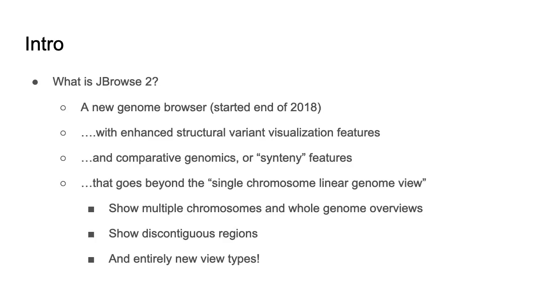And I'll just add a little thing that I think is fun, which is sometimes those are two sides of the same coin. The closer the species are, a structural variant is really just visualizing the comparison between those two things. And we try to support that type of thing. I'll just get into the visuals so we can see.